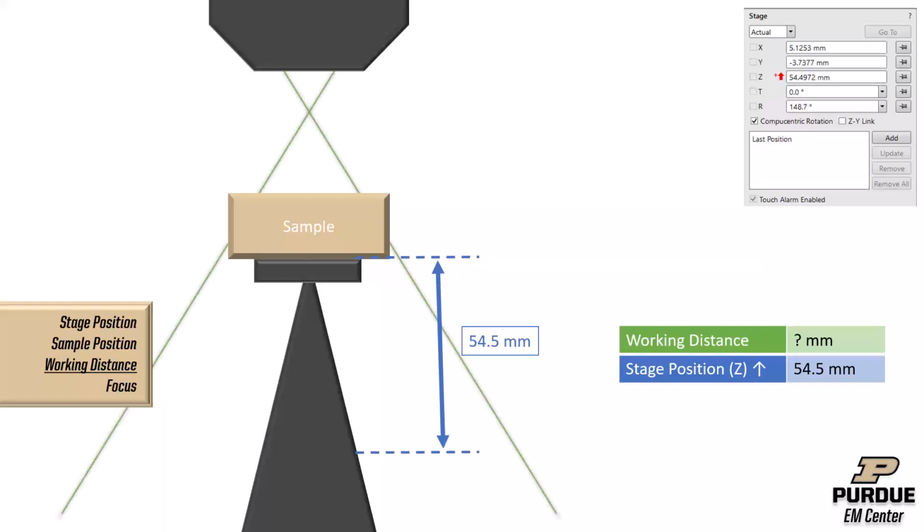So when I add an electron beam to my diagram here, I'm going to show it just as two lines that have a cross point. And in reality, this whole area demonstrated by these two lines is filled with electrons. For the sake of the animation being simpler and the diagram looking simpler, we're going to just represent it by these two lines, but just understand that the area inside those two lines is actually full of electrons. So the electron beam itself does have a focal point where the electrons come into focus, and that happens at this crossover point between these two lines.